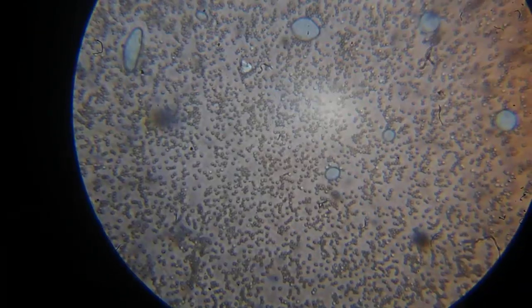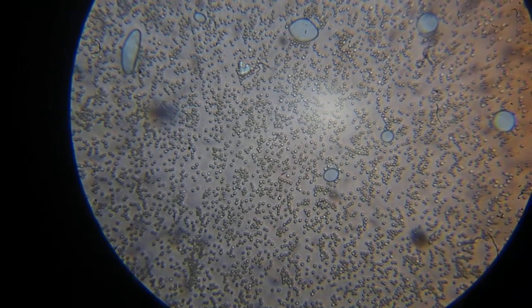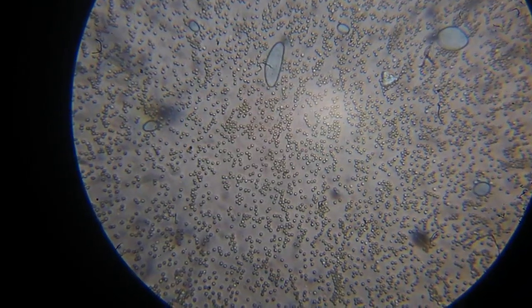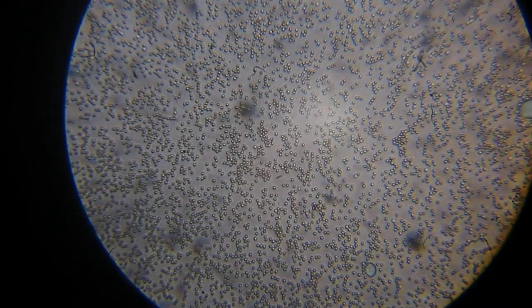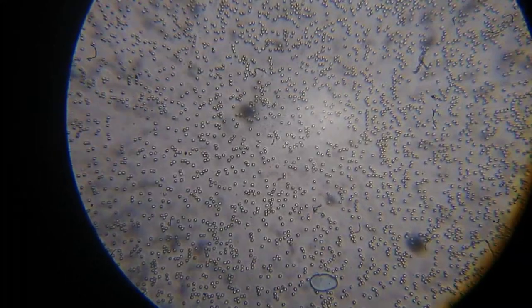Okay, so you see these are not the same color. It's not the same texture. It's very noticeably the texture of rings, little rings. We can zoom in even more.